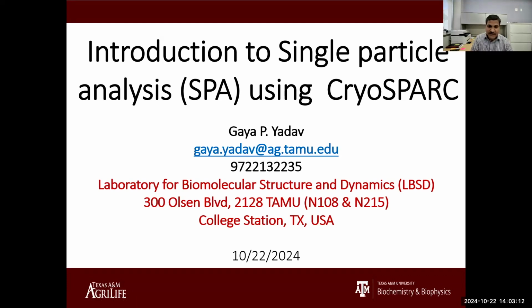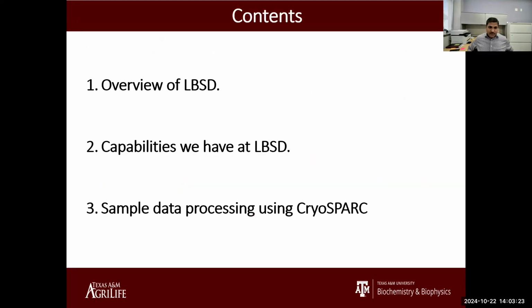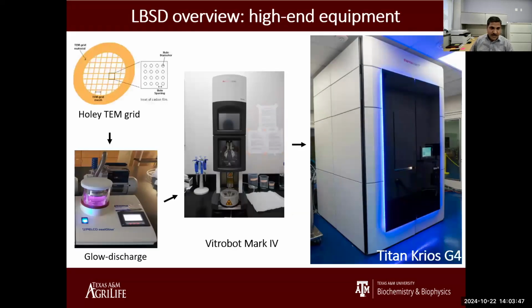As Mike said, my name is Gaya Yadav. I'm a technical director here at the Laboratory of Biomolecular Structure and Dynamics, Department of Biochemistry and Biophysics at Texas A&M. Today I'm going to give a brief overview of the facility here in the Department of Biochemistry and Biophysics, and then also tell you what different capabilities we have, and then we will quickly go to the data processing using CryoSPARC for the single particle analysis.